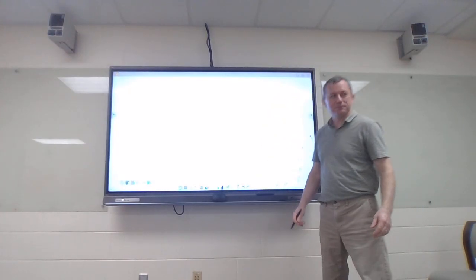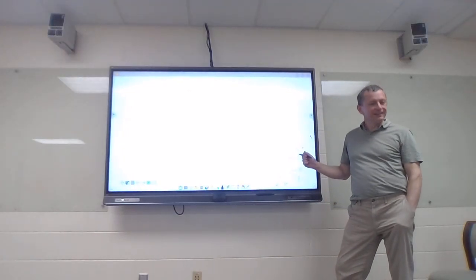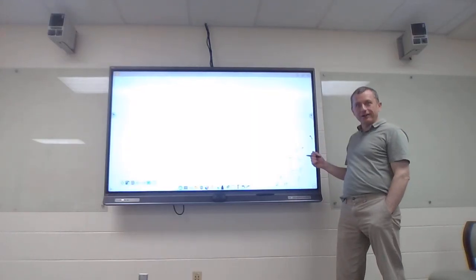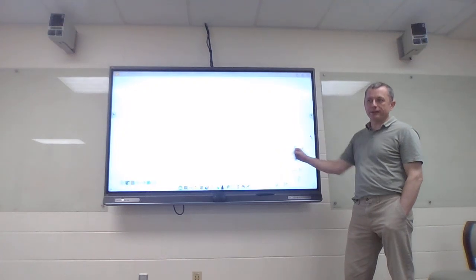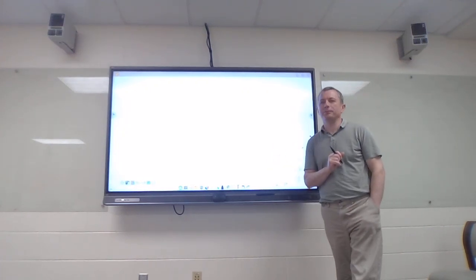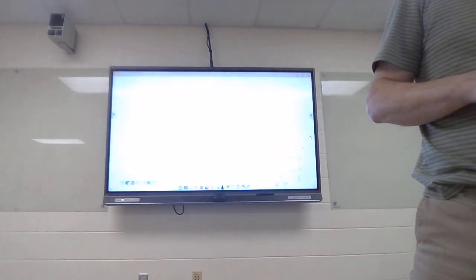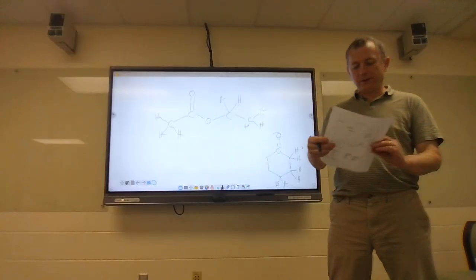So once again, does the splitting tell me that structure? I can get it from the molecular formula, the IR, and that integration. Just by looking at chemical shift and integration, that's the only way I could put that molecule together, even though the splitting got really wild. One of my favorites.